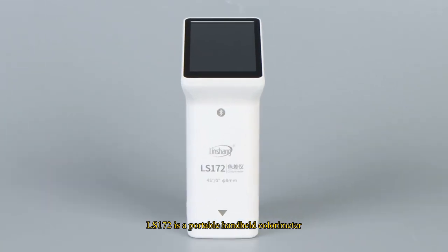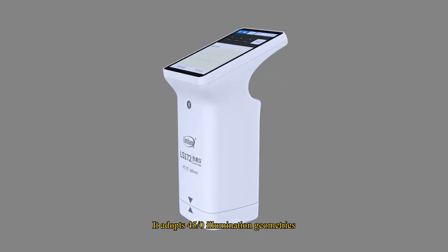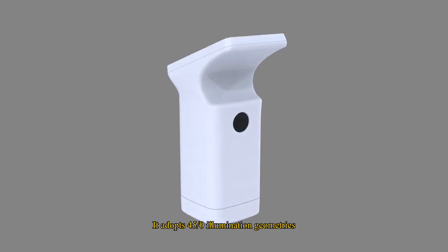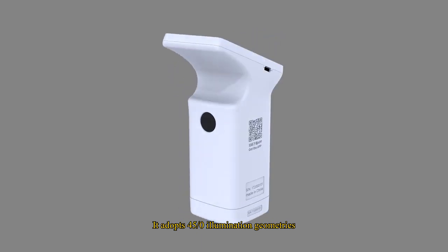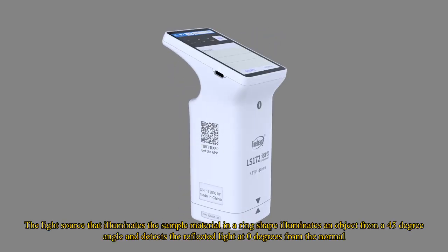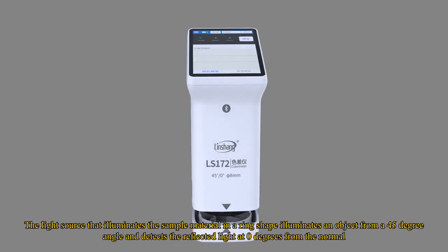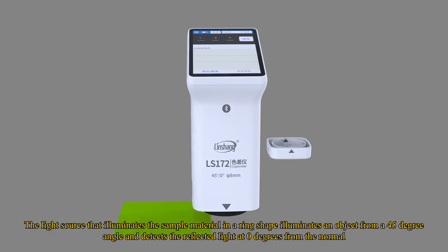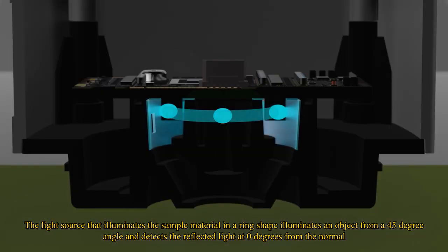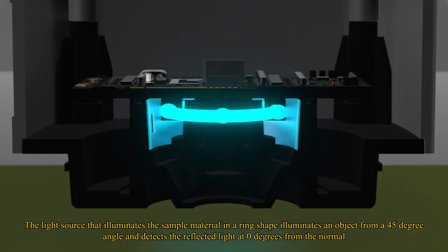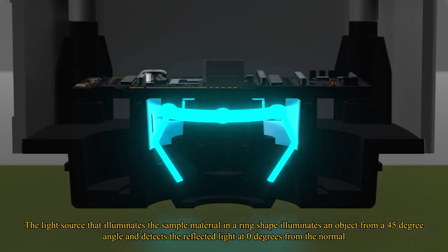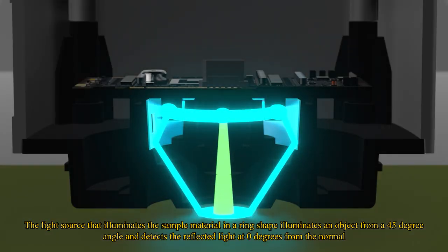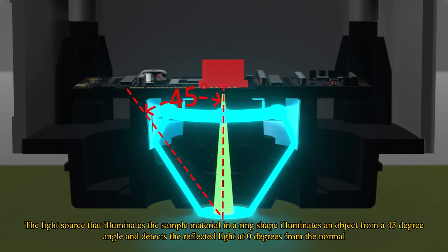LS172 is a portable handheld colorimeter. It adopts 45-degree illumination geometries. The light source that illuminates the sample material in a ring shape illuminates an object from a 45-degree angle and detects the reflected light at zero degrees from the normal.